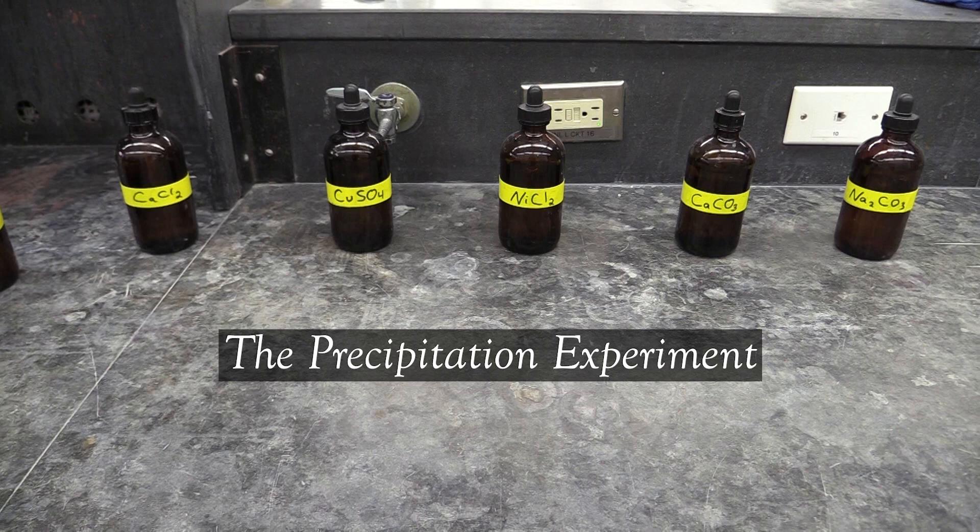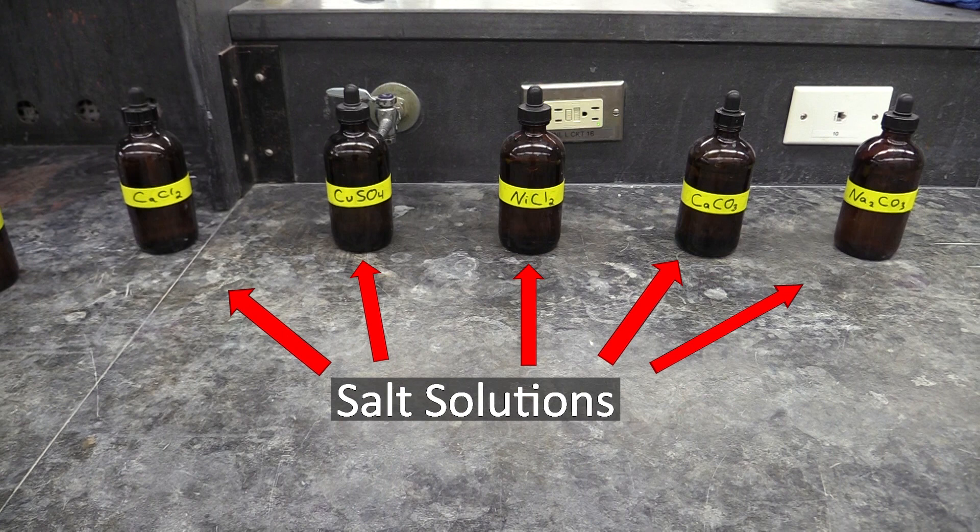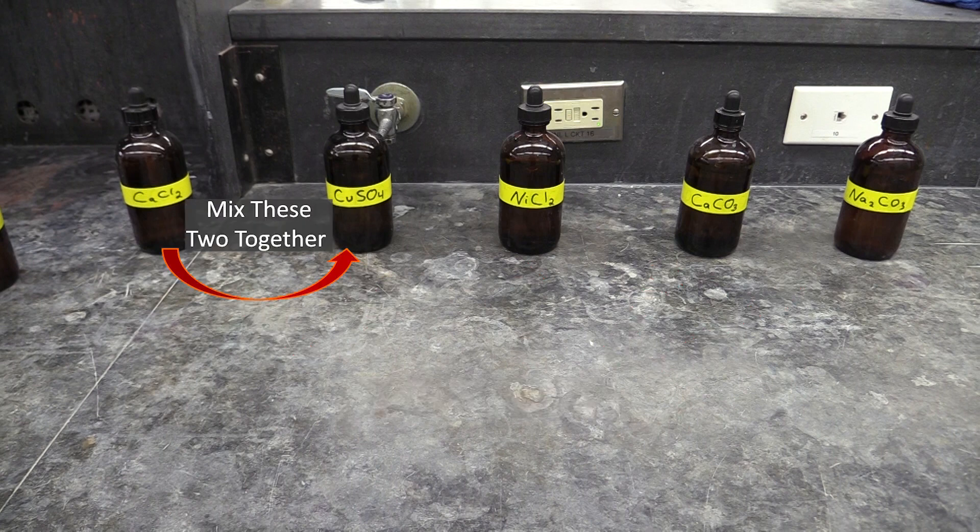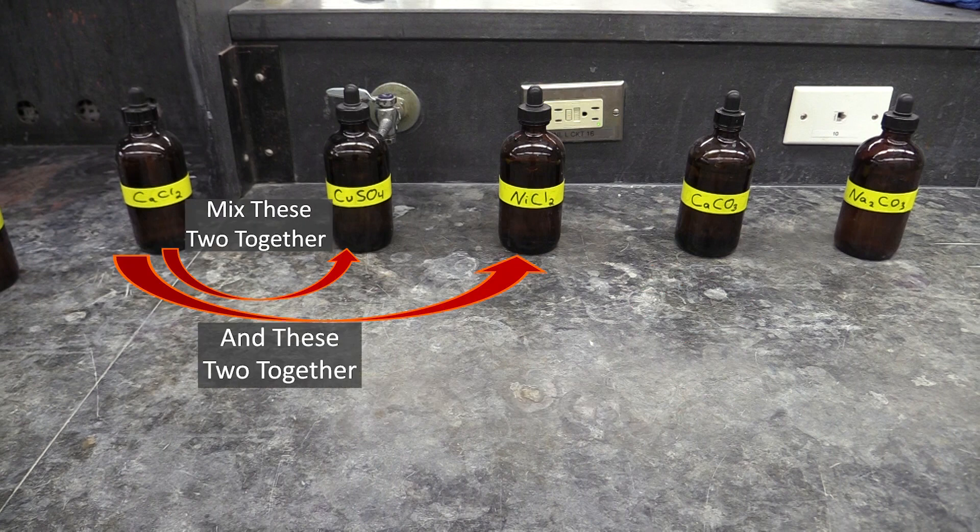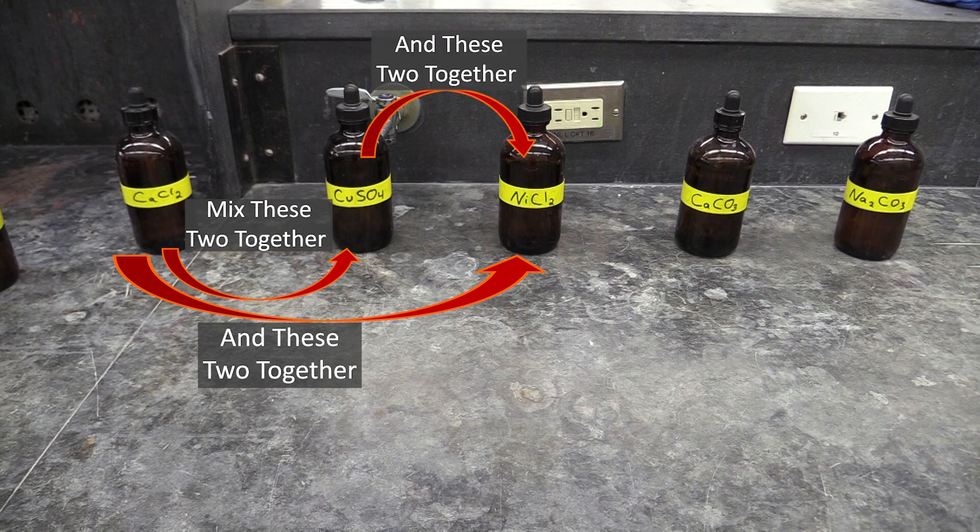The first experiment in your procedure involves the precipitation of insoluble salts. In this one, you will take several different salt solutions, mix them together two at a time in every possible combination they can be mixed, and see whether or not you get a precipitate.